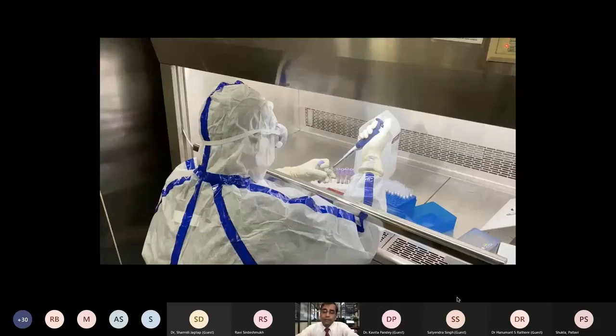So in all of these sample preparations, of course, the sample I'm showing you is from a project we did recently on COVID, where we had to be extra cautious about infection, given the nature of these samples, in the BSL2 labs. But even otherwise, when you are working on any kind of clinical sample, it is a good idea to make sure that, even if the sample may not be contaminated, you may have tuberculosis or something else in that sample. So take extra precaution and biosafety measures before you process those samples.